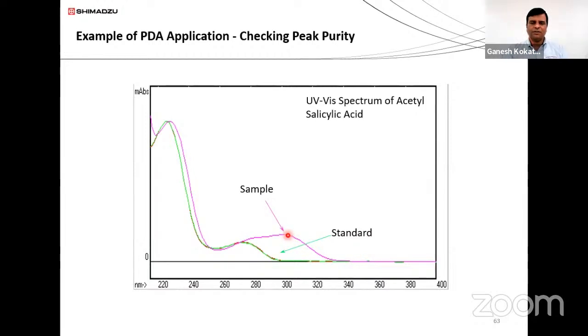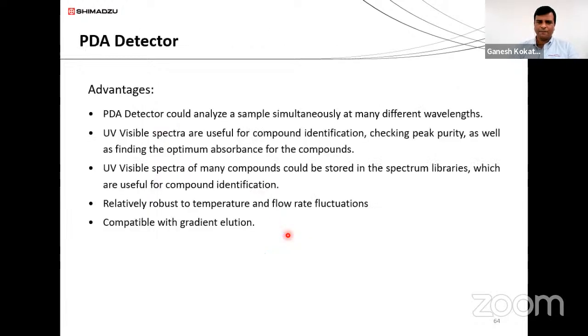So to check the peak purity, PDA is also useful. If the peak is present in the tailing or maybe fronting, or it is getting completely merged with the peak, the PDA helps us identify it. And if I identify that the main API contains some impurity, I also need to develop a method which helps me resolve these kinds of impurities.